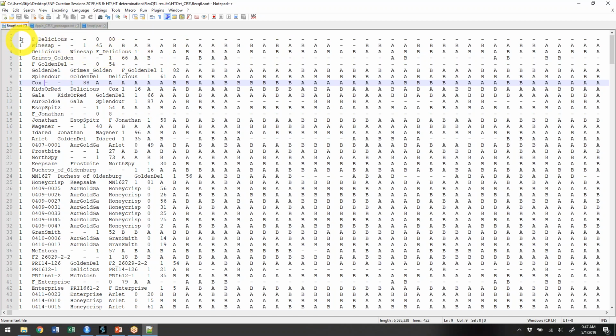It starts with a population, then an individual name, then the two parents. In our case, we had one nuisance variable and one phenotype variable, and then all the alleles. The only difference with this file and our data file is that this one has been sorted, and that's why it's called .sort. And it's sorted in a way that parents are always higher in the file than their offspring.